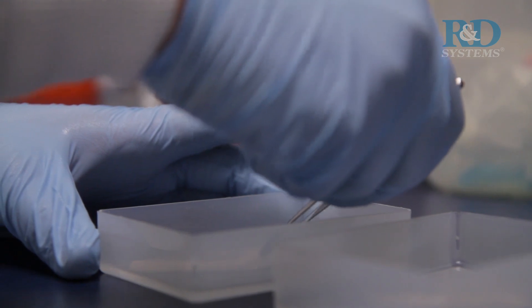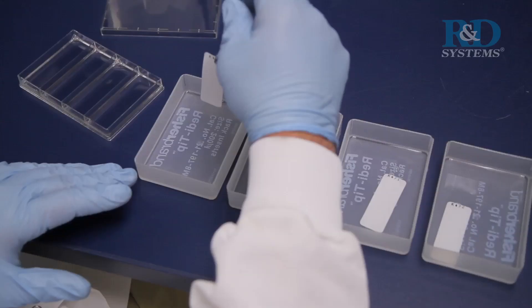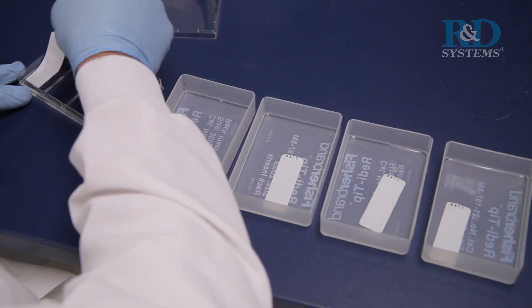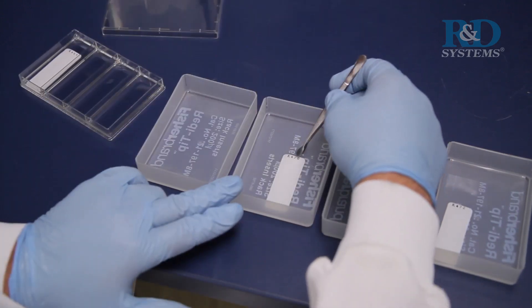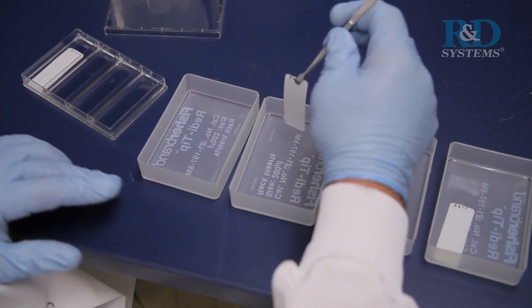Then, carefully remove each membrane from its wash container. Allow excess buffer to drain from the membrane and return the membrane to the 4-well multi-dish containing the diluted antiphosphotyrosine HRP.